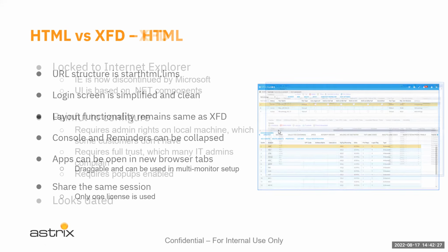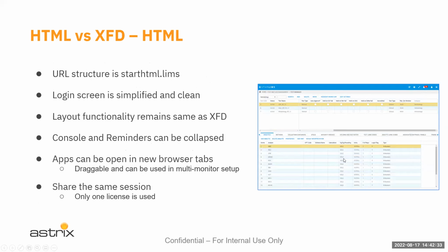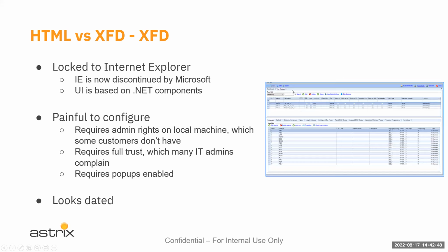Now you can see though, it wasn't like they started from scratch, right? They just took what was here and did a conversion. And everything, for the most part, is in the same place that you expect. So if you're familiar with this one, here you just get a different look and feel. But that was because, again, it was many years, many applications. They weren't going to start from scratch. So it was more of a one-to-one conversion.